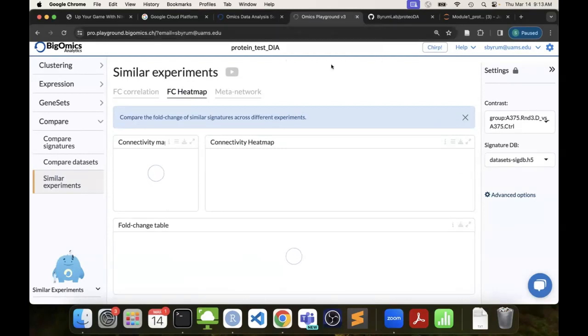What sort of data? So this will be count data for RNA-seq, any omics type data set on the genomic side, but the protein data I loaded in my normalized intensity file. So they have a normalization in the software, but again, I just turn that off and go ahead and normalize my data set myself and then load it into the software. A lot of people asked them for that, so they went and added that feature.